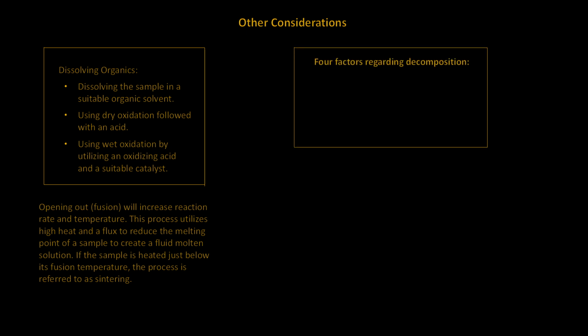Four factors determine decomposition. The smaller the particle size, the larger the surface area of the sample. This results in more surface area for an acid to attack. Temperature increase allows for a more rapid decomposition due to a greater thermal agitation of the molecules. The larger the sample size indicates a larger amount of reagent to be used, which in turn increases the length of time it takes to decompose the sample. The amount and the concentration of the acid or base solution will also determine the rate of decomposition and the efficiency of the solution to attack the sample.